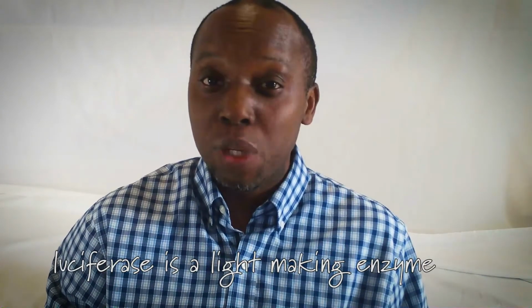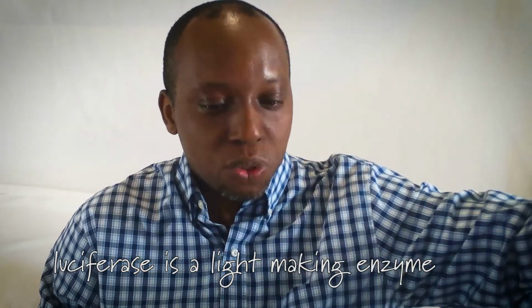That's the luciferase enzyme. Luciferase is a light-producing enzyme. Very simply, it's very similar to the enzyme in fireflies, which you see them light up, or in seaweed when it glows in the dark on the top of the ocean. There are many of the similar enzymes present in nature. Those enzymes take ATP and make light. The more ATP, the more light. Very simple process. So by the enzyme being present in this tube, it uses the ATP present in that tube and produces light. That light can then be detected by this sensor here.